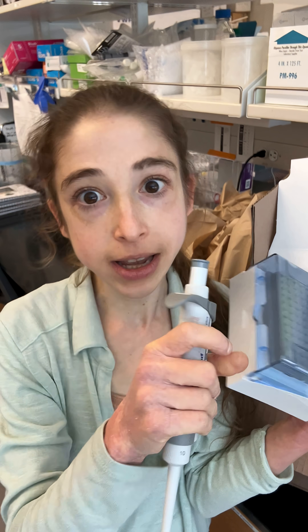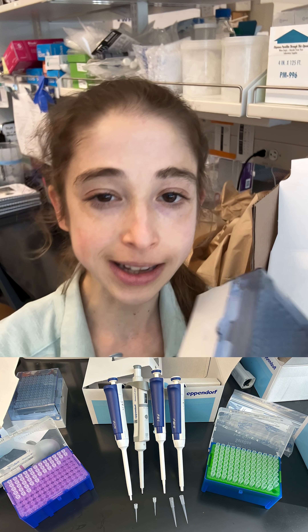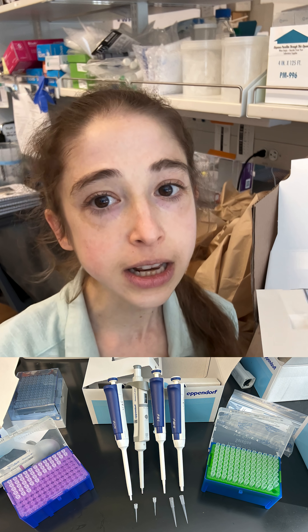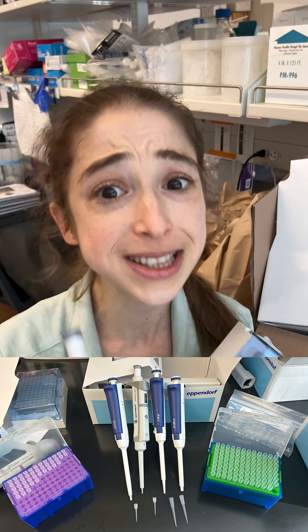Before, all I had was a P-2 and then you had to go to a P-20. The P-20 could do 2 to 20 and the P-2 could do 0 to 2. But when you're in that range between 2 and 10, you had to use the P-20, which uses the same tips as the P-200.